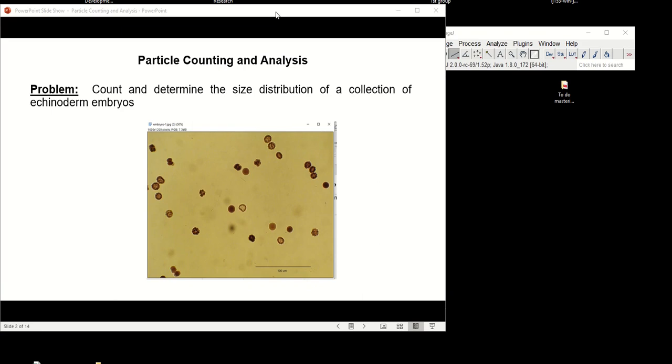In this video tutorial, I want you to learn how to count and determine the size of a collection of embryos. You can do it one by one, or you can just tell FIJI to help you to do it. And in this case, it's possible to do it. So let me show you what you have to do.